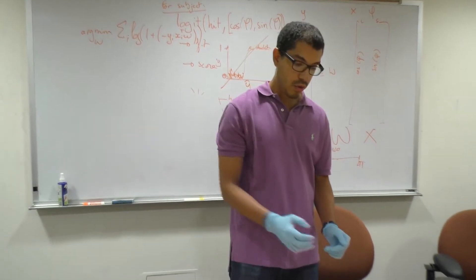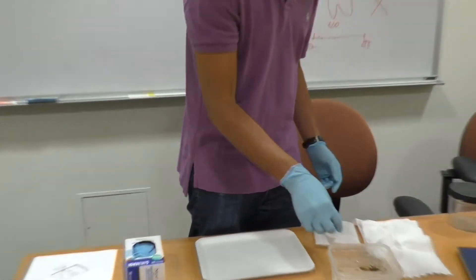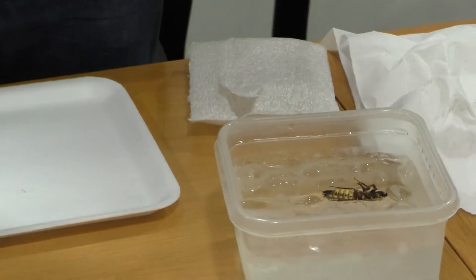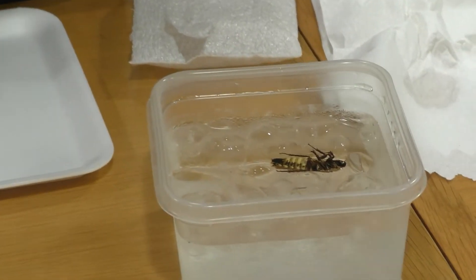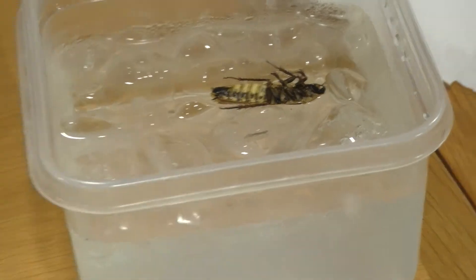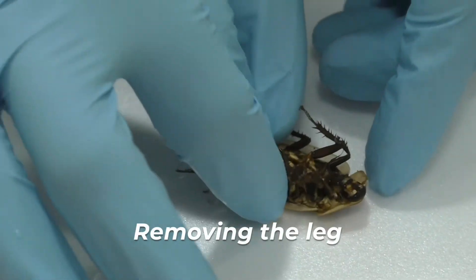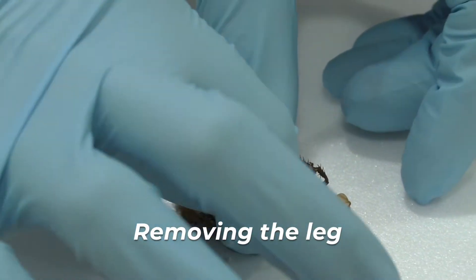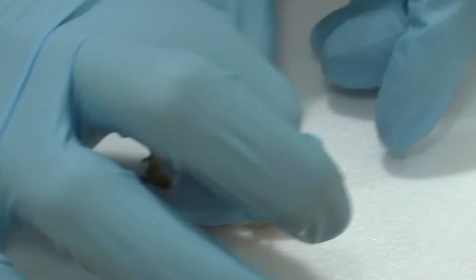Okay, so once you have your roach anesthetized, you're going to want to take it out of the ice and you're going to want to pull off one of its back legs. So when you pull off one of the back legs, you want to start from the inside and pinch it and pull it off in one motion. So take it out of the ice. Just like that.